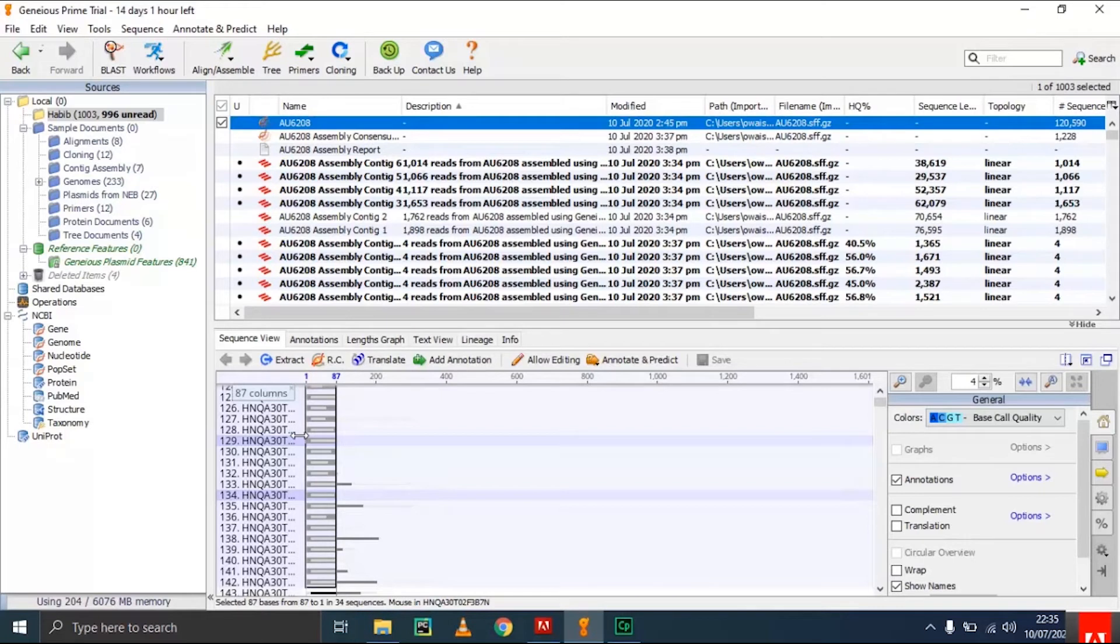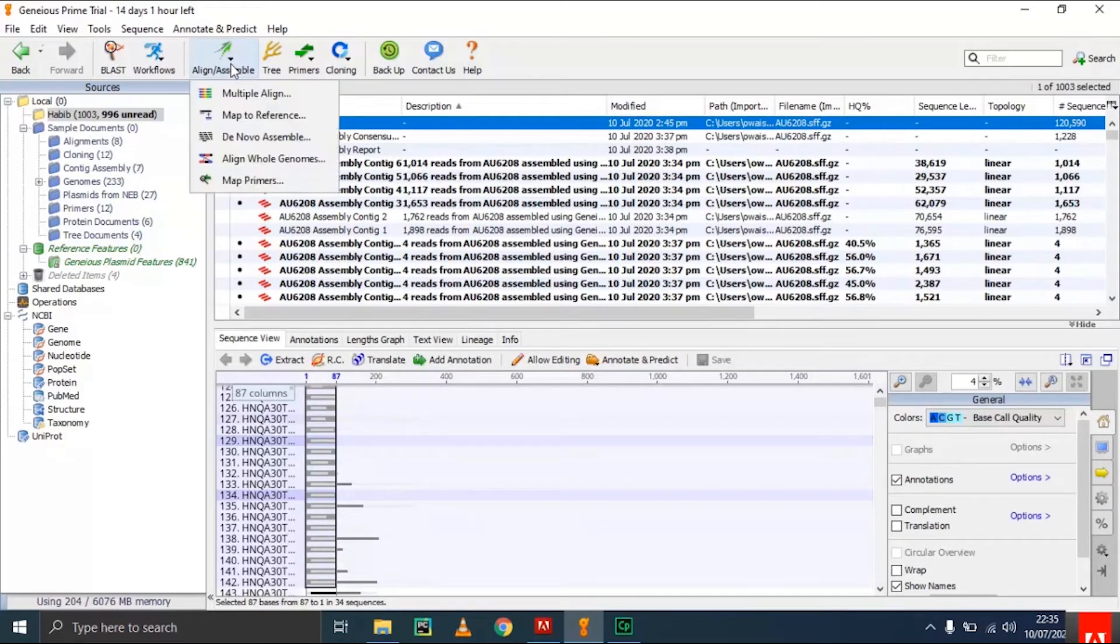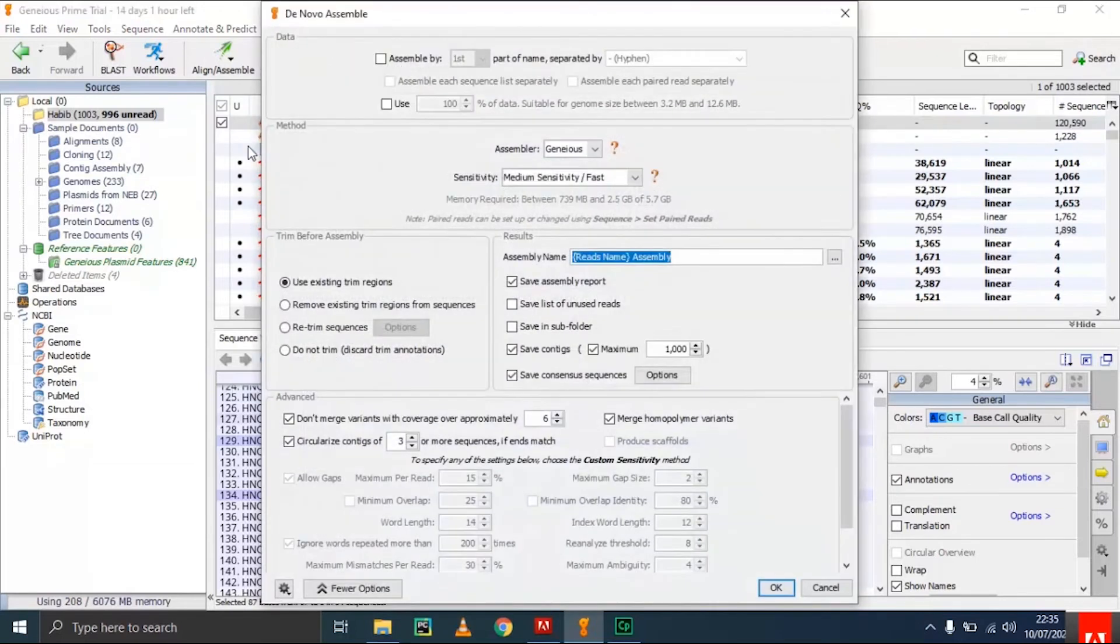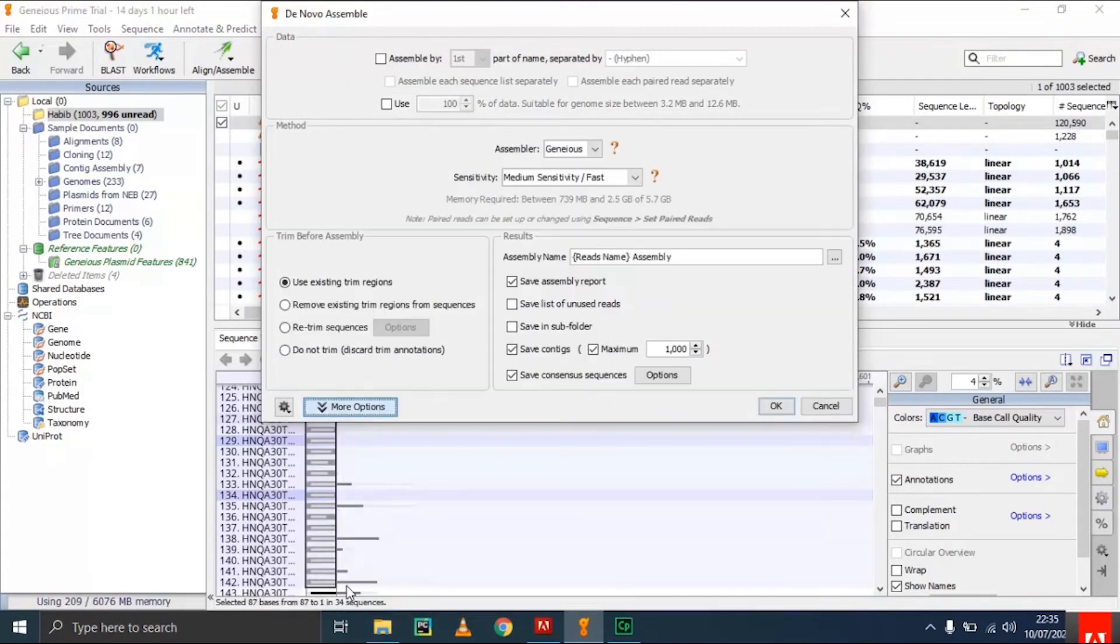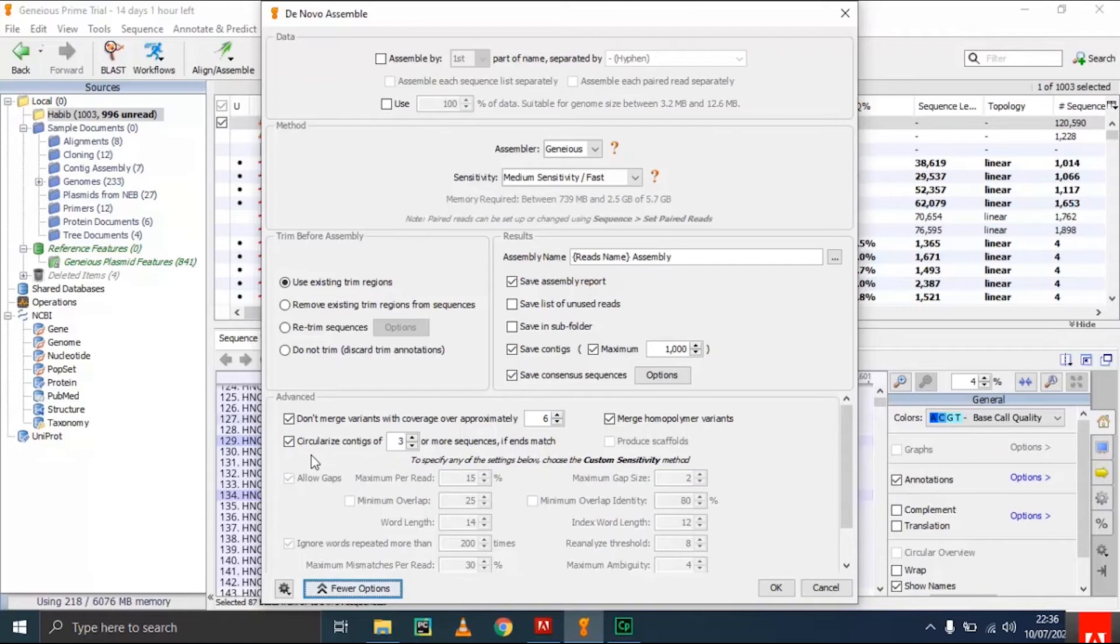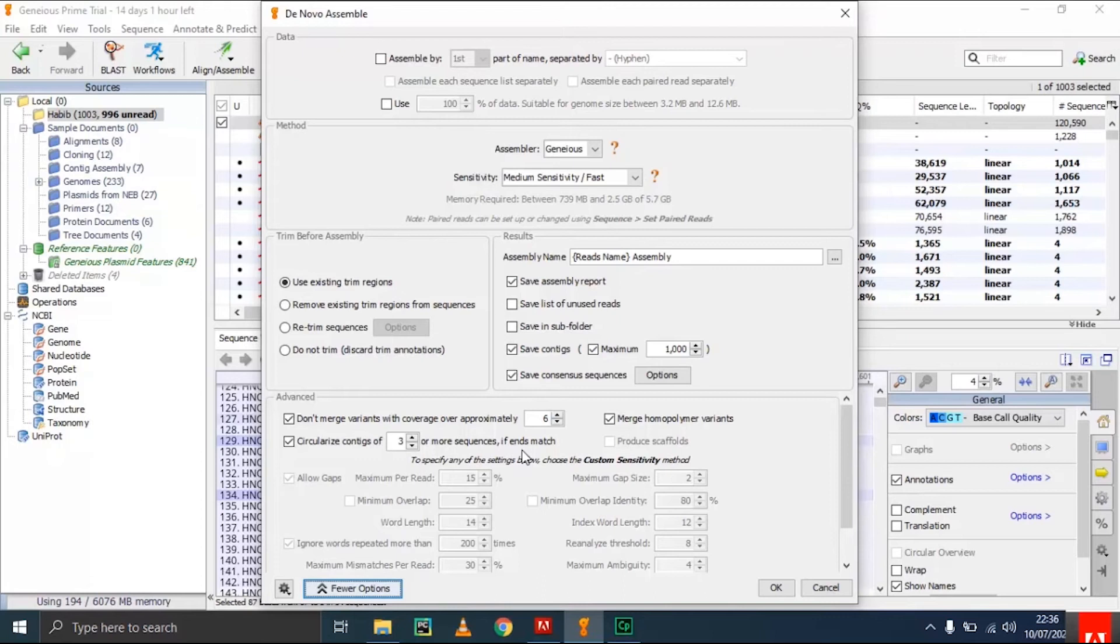After getting the reads, you go to de novo assemble and click on it. This shows the default parameters. I recommend checking this box: circularize contigs of three or more sequences with end match. This will help if the ends of the fragments are matched to create circularized contigs of three or more sequences.